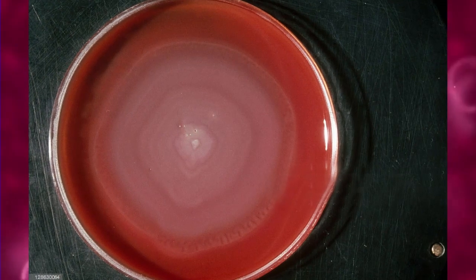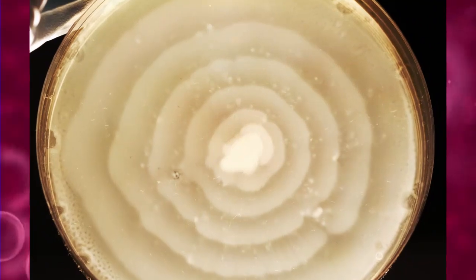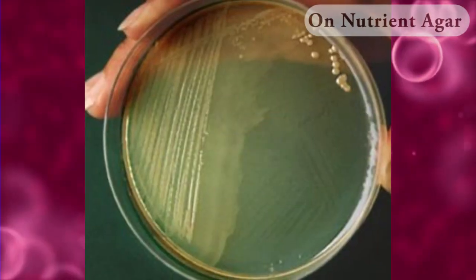Swarming is described as the formation of concentric zones of bacteria growth. Hope this video was helpful to you for getting an idea about Proteus colony morphologies.